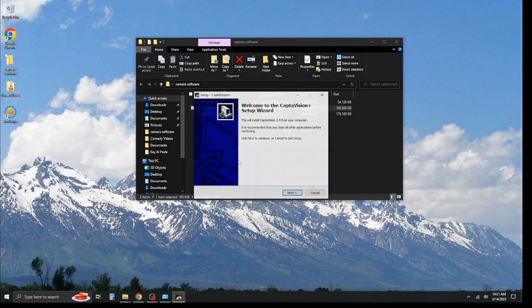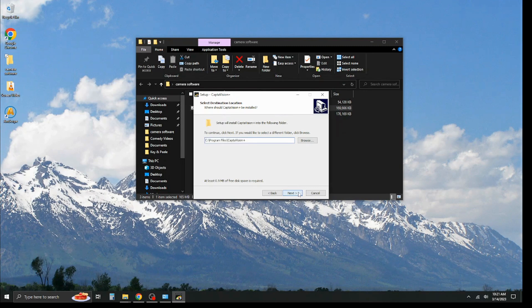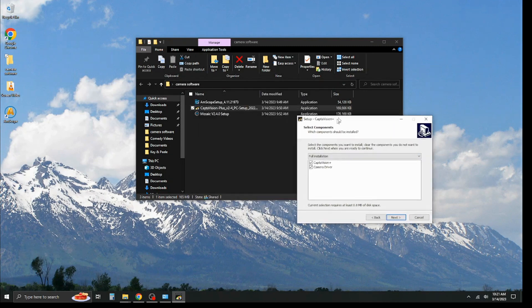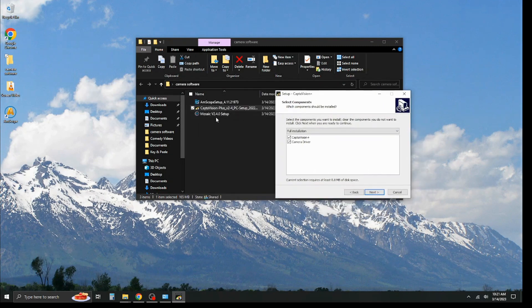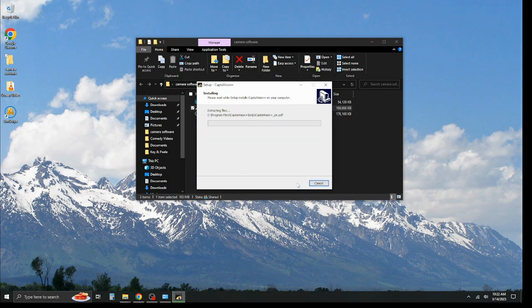Go ahead and hit yes to install when that prompt comes up, and we're going to click next. Now, something that should be noted about this CaptaVision software and the Mosaic software V2.4 for the Tucsen cameras, number one, they both install the drivers for you for the cameras, but two, they require admin rights to run.